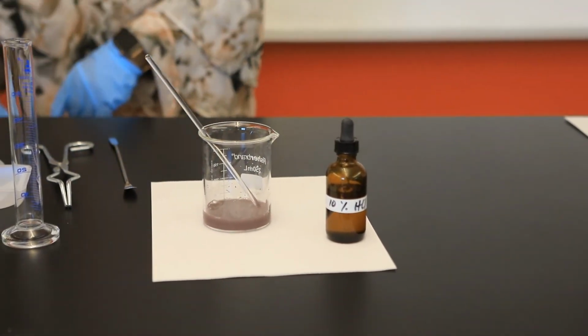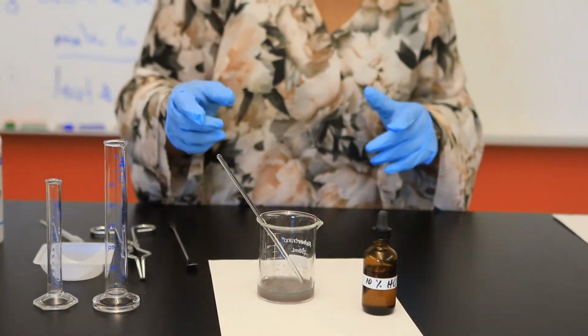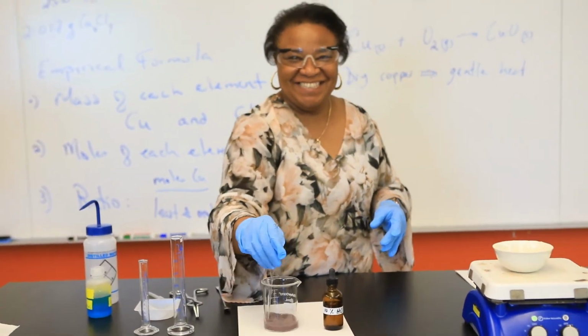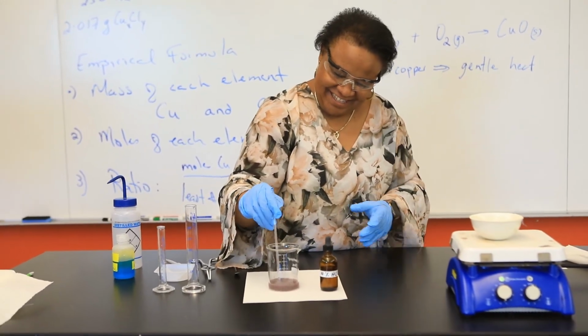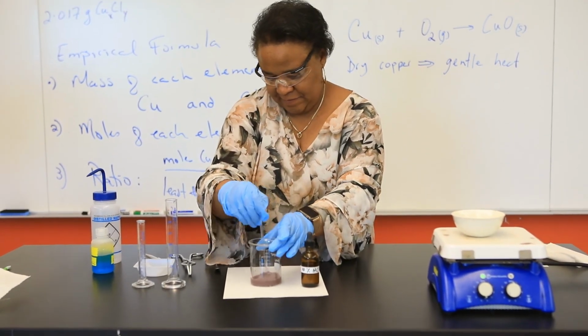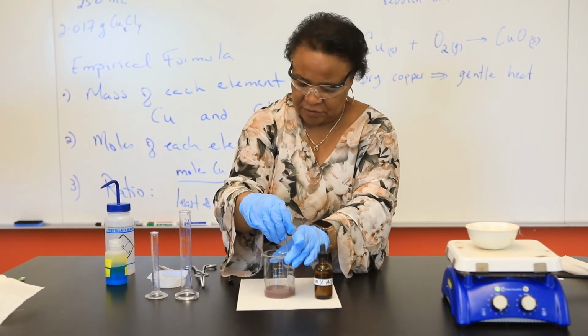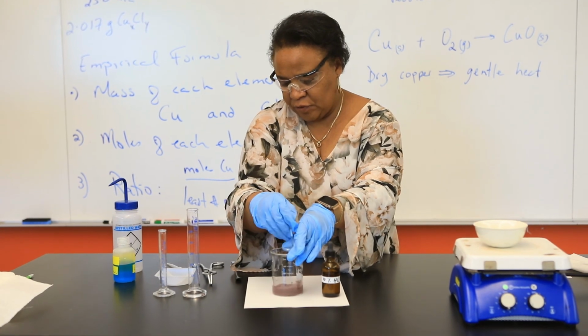Okay, so I'm going to let that settle for a while and see if I see any tint of blue, and I probably still do. So I'll keep on stirring away. Notice, however, that the solution now looks somewhat reddish brown once I've stirred.